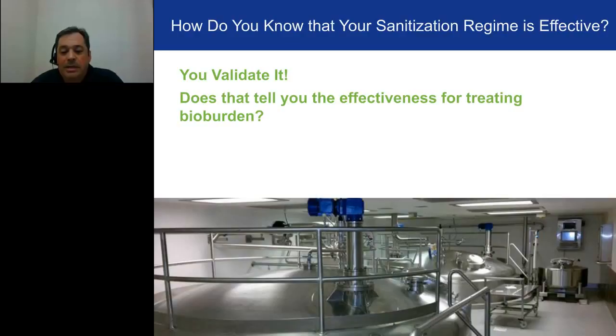And I'm sorry to say, in some cases it doesn't, because in the manufacturing environment, one of the things we can't do is we can't introduce a challenge. We can't put microorganisms into that environment. Nobody wants us to introduce bacteria into something that we're about to make their pharmaceuticals in. So it's not sometimes a very rigorous challenge, the validation process. But it is the way that we currently do it.